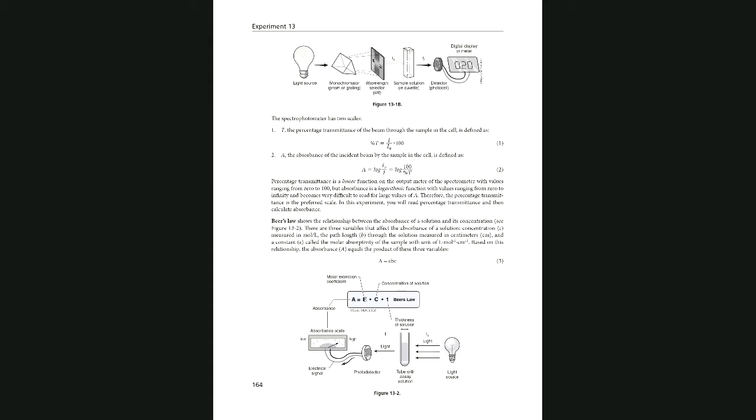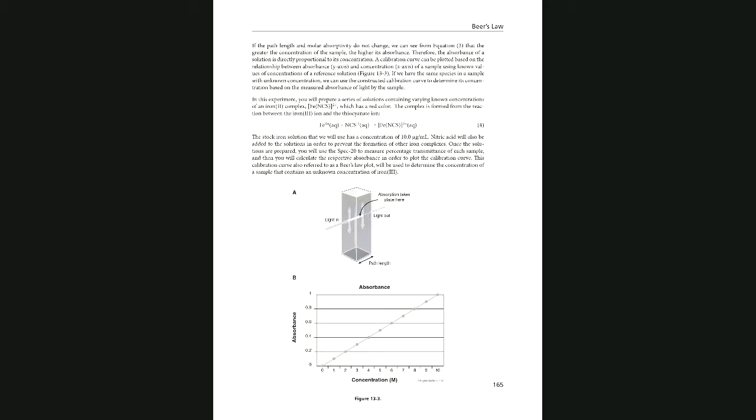Basically, the concentration of the solution is directly related to the absorption. The higher the concentration, the higher the absorption. That is the idea that we are going to use. In order to use this technique, we are first going to build a calibration curve, based on known concentrations of our solution.